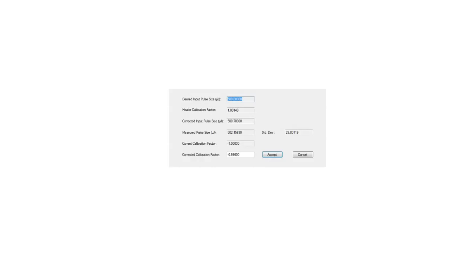If you are comfortable with your new calibration factor, click Accept and then you have now performed your new electrical calibration on your ITC.